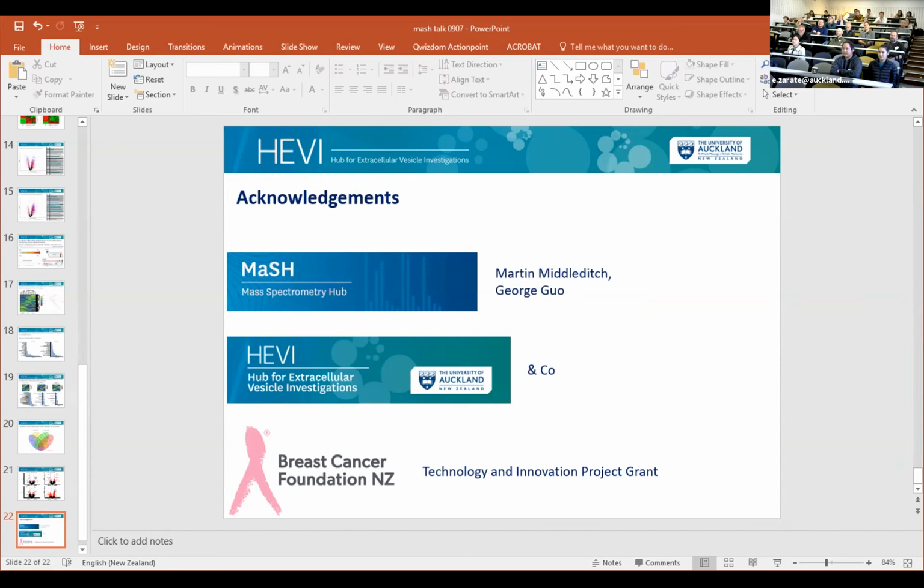Okay, we haven't been using the USS Enterprise for our work. It's something probably a little bit more expensive than that. The Solaris FTICR, which is based up here in the Iron Innovations Lab. And this is a very, very impressive machine, with very high mass accuracy and mass resolution, which is really essential when you're doing MALDI work, because we're doing in situ localization. We can't do any LC separation, so mass accuracy becomes really important.